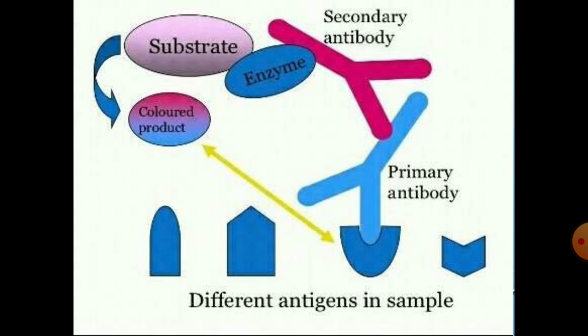In the simplest form of ELISA, the antigens from the sample to be tested are attached to a surface, then the matching antibody is applied over the surface so that it can bind the antigen. The antibody is linked to an enzyme and then any unbound antibodies are removed. In the final step, a substance containing the enzyme substrate is added. If there was binding, the subsequent reaction produces a detectable signal, mostly a color change.